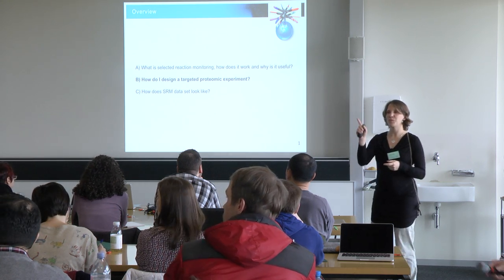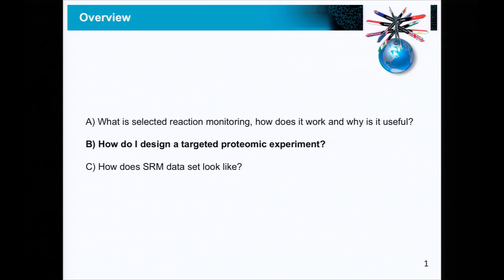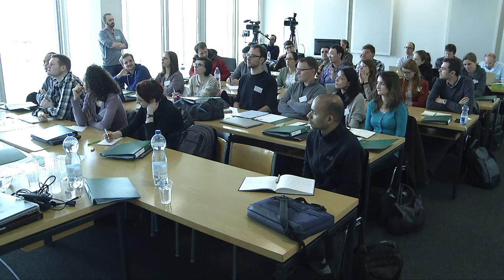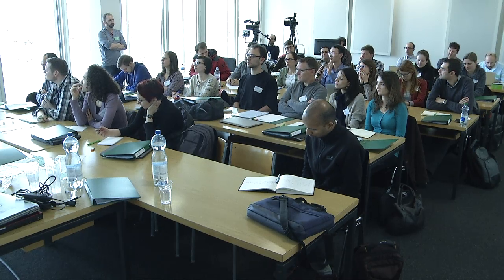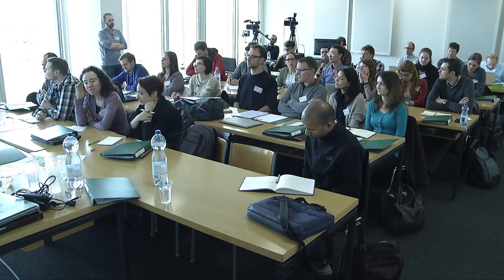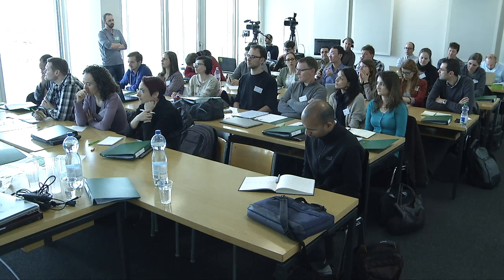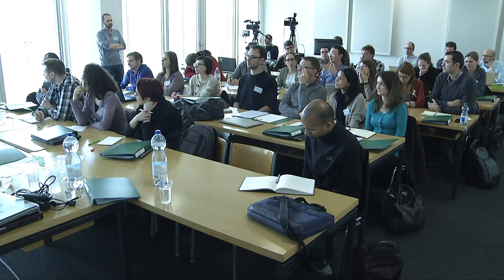Yeah? Sorry, do you mind? Thanks. I just have a question about the settings. If I'm interested in several proteins or several peptides in the same sample, and you want the quantitative data to be comparable between these two, do you need to set up the same dwell time or cycling time for all the peptides or proteins, or do you set up optimized for each of them?